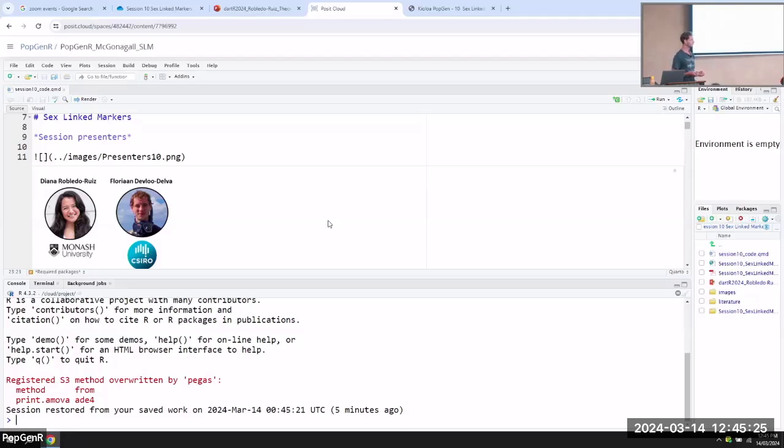And then the main point of this session is actually to load up your own data and have a look, because that's the most interesting bit, to see what you have in your own data. We can show you how the function goes, but you're the one who makes the question about it.